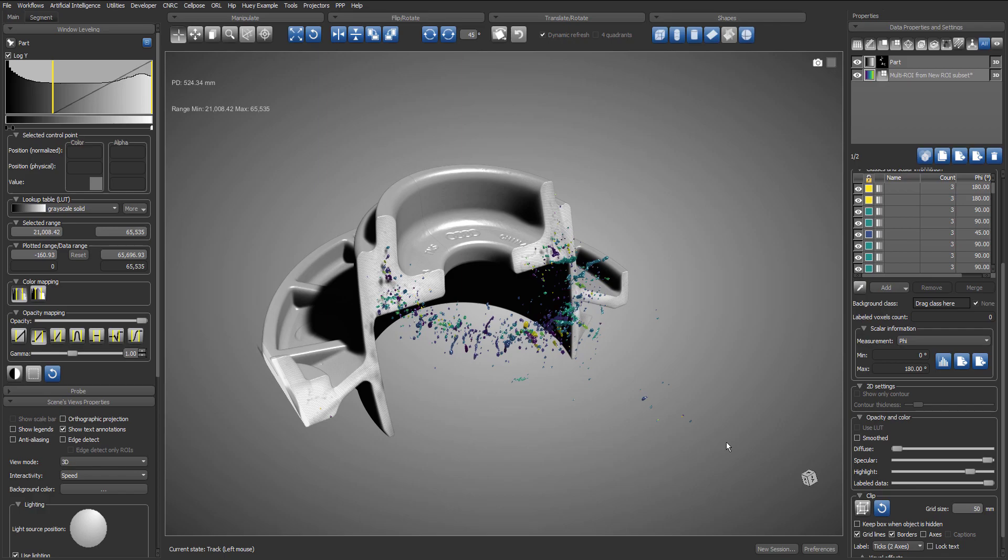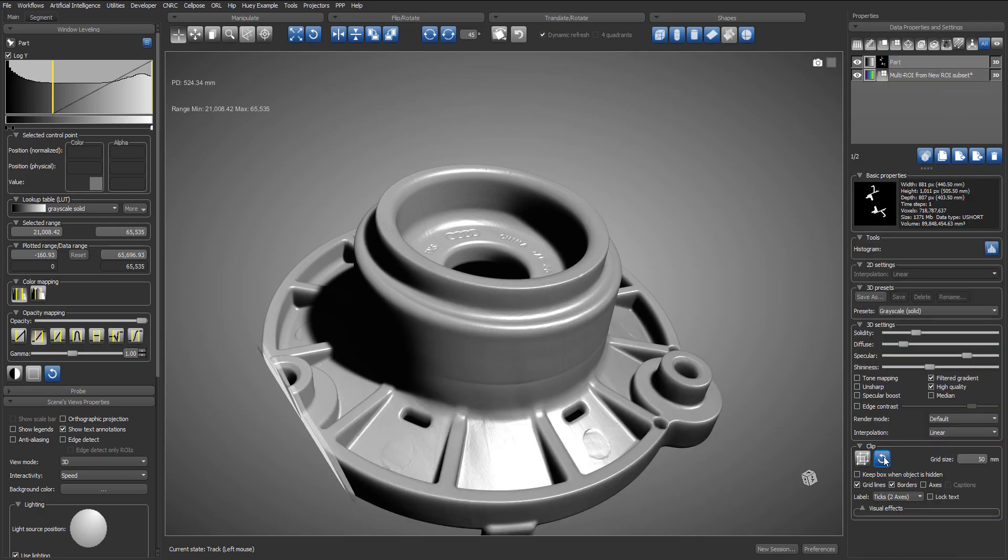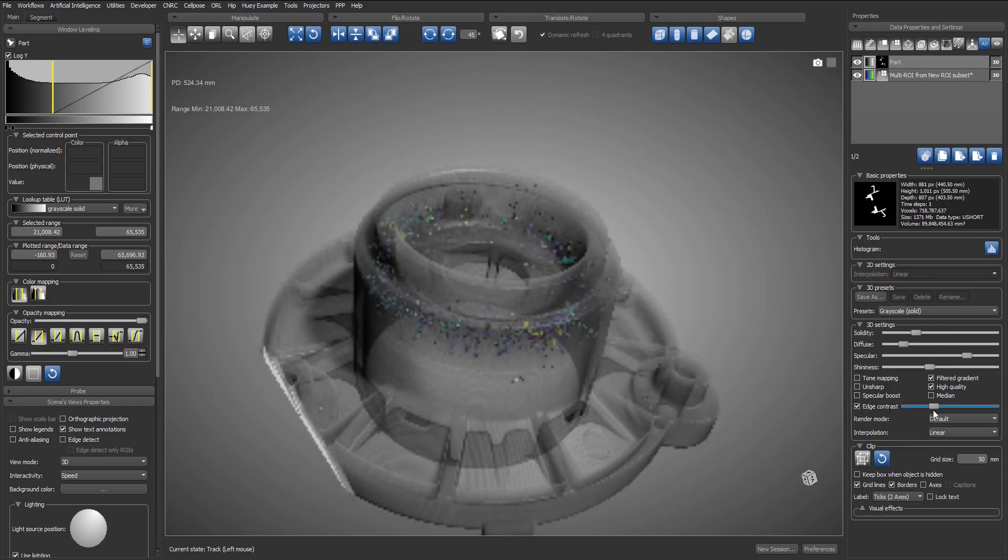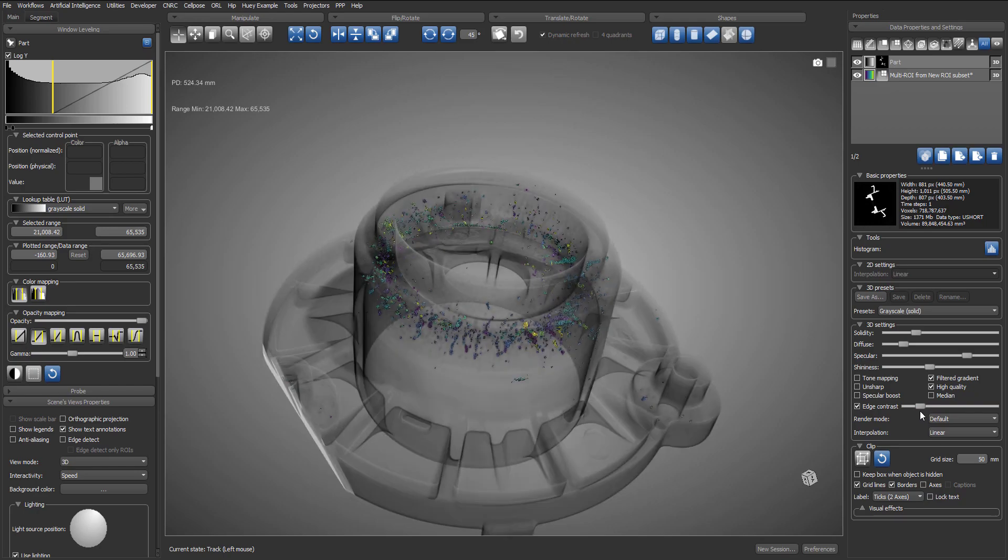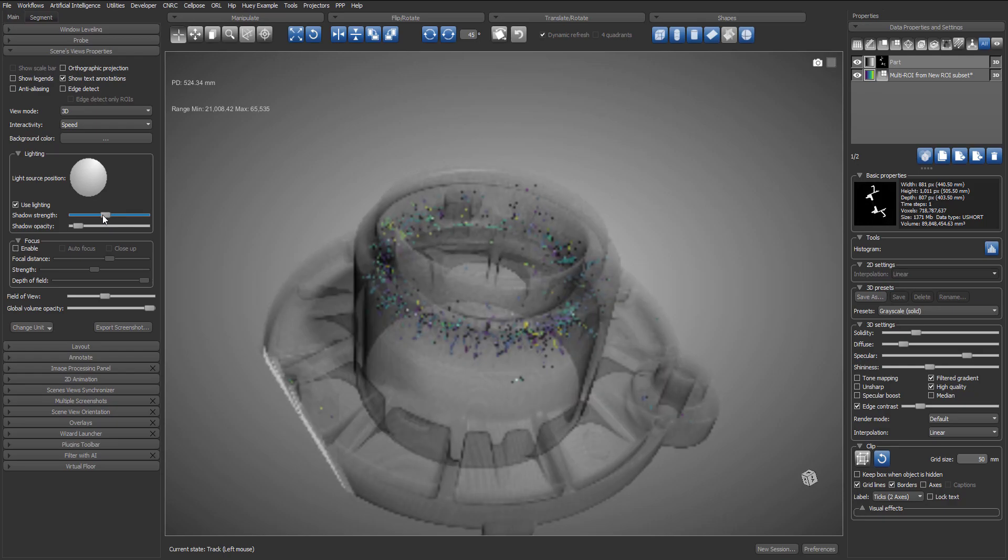To have a better understanding of the position and distribution of the porosities inside the dataset, I will reset the clip box of the dataset. And instead, I will use the edge contrast option. And by using the slider, I will adjust the edge threshold. And I will use the lighting sliders to make the edges brighter.